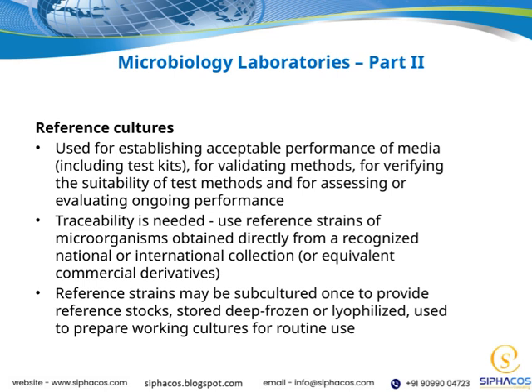Once we obtain these reference strains, we can subculture them once to produce reference stocks. These stocks are then stored properly, either deep frozen or lyophilized, to preserve their integrity. From these stocks, we prepare working cultures that we use routinely in our laboratory testing. Overall, using properly sourced and stored reference cultures helps maintain the accuracy and consistency of microbiological testing, which is vital for ensuring the safety and quality of our products and methods.